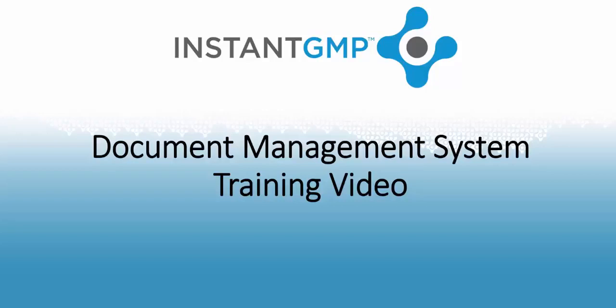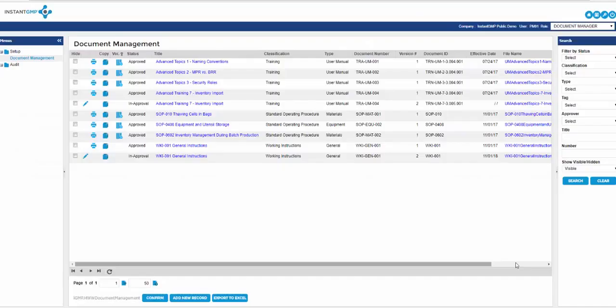In this video, we're going to cover adding a document and going through the approval cycle. Let's get right to it. Let's work from left to right. Here, you have the ability to hide documents. You can print documents. And there's the ever familiar edit, copy, and version up icons.